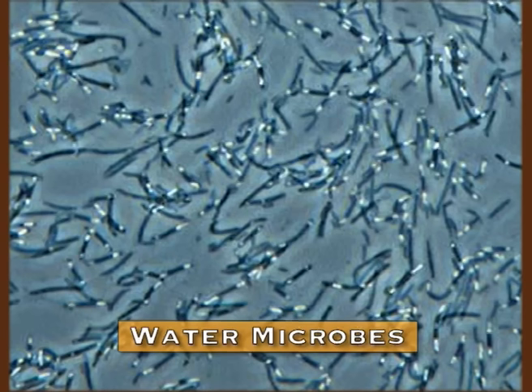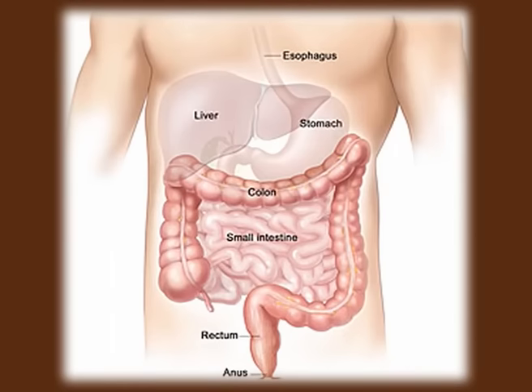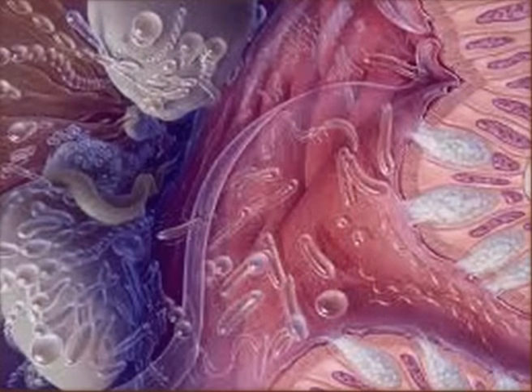Why? Because generally the contaminated water contains E. coli, which are generally passed from the human intestinal tract to the water supplies. Now, if there is a water contamination with E. coli, then it will be able to grow on EMB plates or on MacConkey agar plates, and hence it is useful to study whether the bacteria is present in the supplied water specimen.